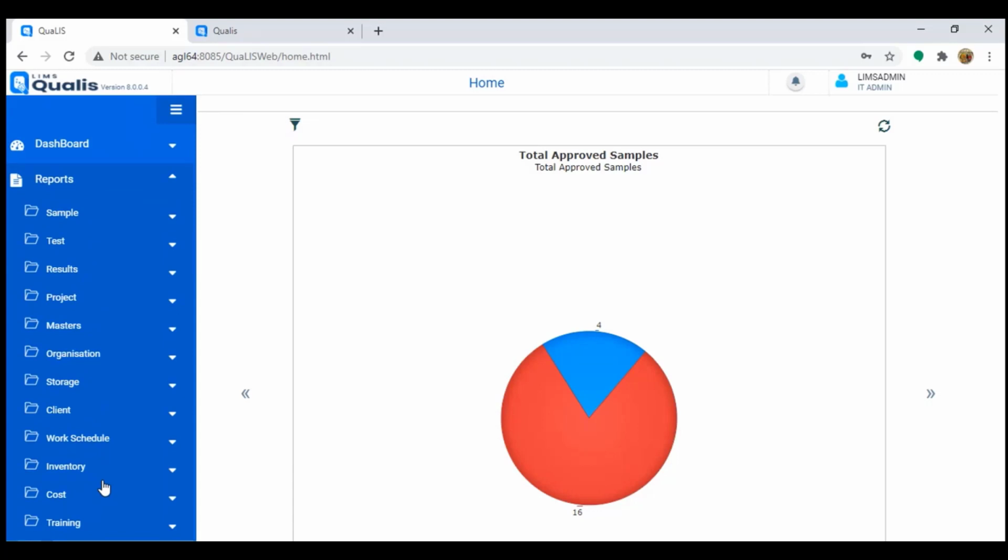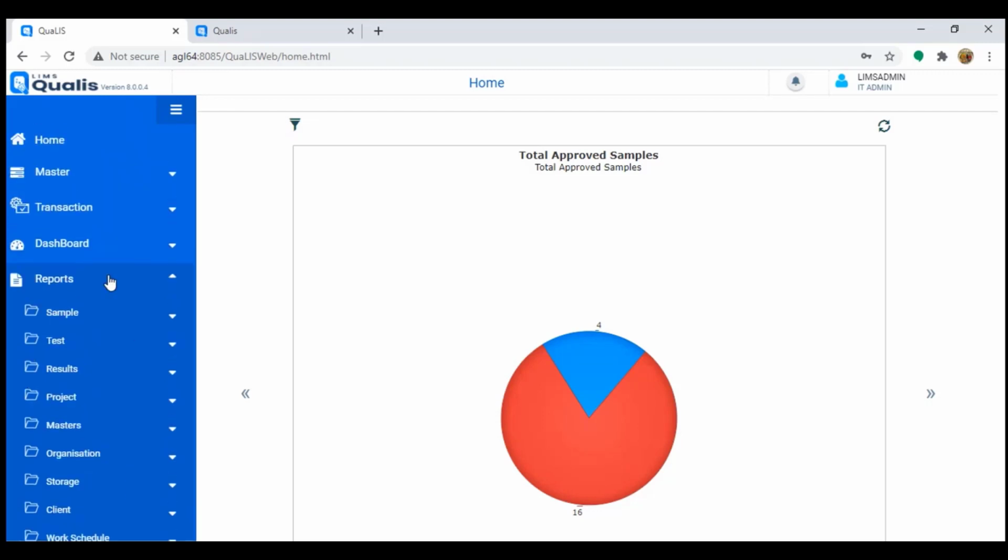As I said, LIMS is all about tracking the work and making sure that all the activities have a workflow. That is what LIMS is helping with laboratories. They can define the workflows, how the flow goes from sample registration till report. And there is a complete traceability using different reports and dashboard. That is the whole purpose.